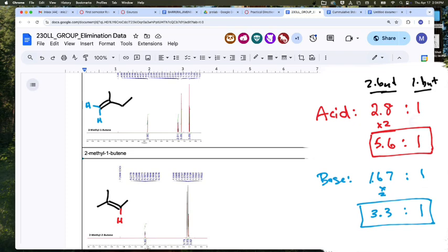It's not that there's two possible products, it's the number of hydrogens that represent it. So if I had just a 50-50 mixture, one of the 1-butene and one of the 2-butene, okay, what would the height of the peaks be? Well, there's only one of each. Shouldn't they be the same height? The 1-butene is represented by 2 hydrogens, which means it's going to be twice the height because there's 2 hydrogens representing it.